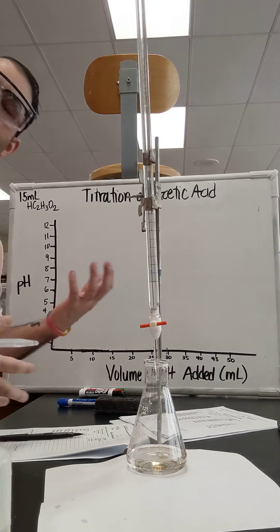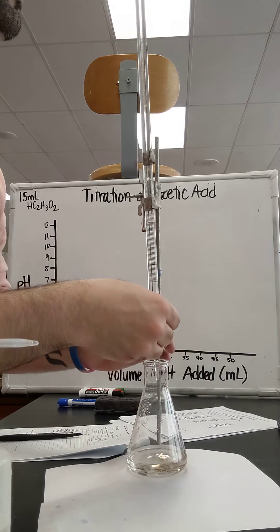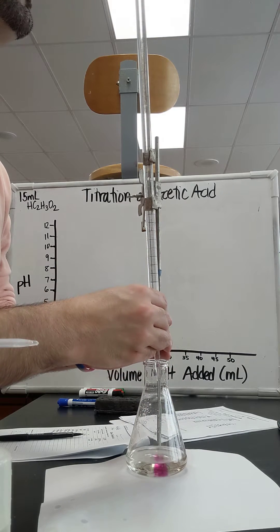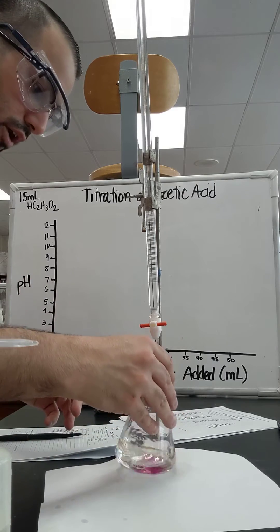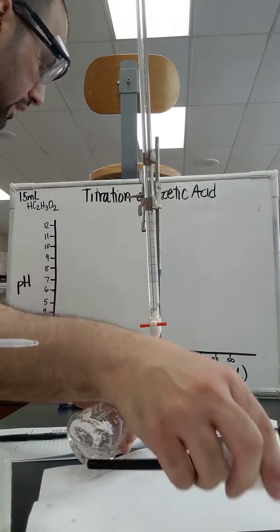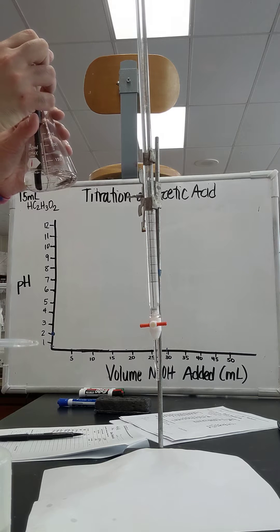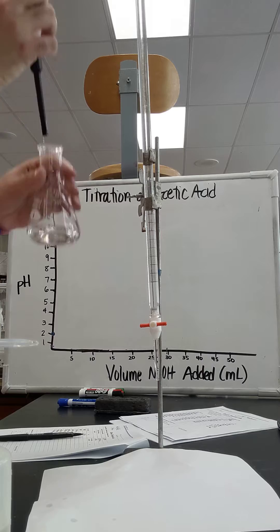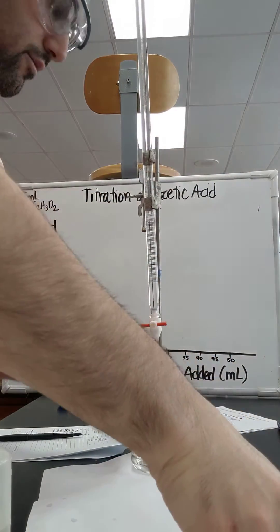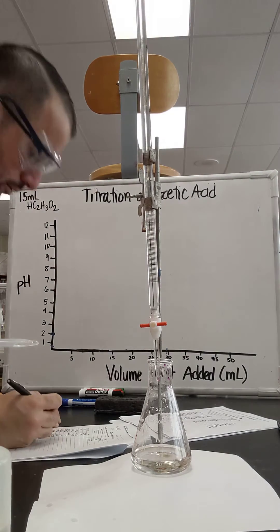And there's two decimal places for the burette, so I've been recording them at 7.50. Let's do another 0.5, let's go to 8 milliliters. Look at that pink, it's getting really dark. Taking a pH, I got 5.47. That's my pH and I have 8 milliliters in there.